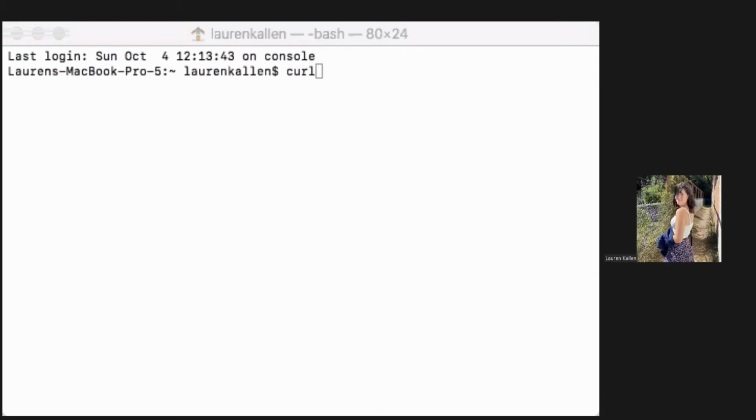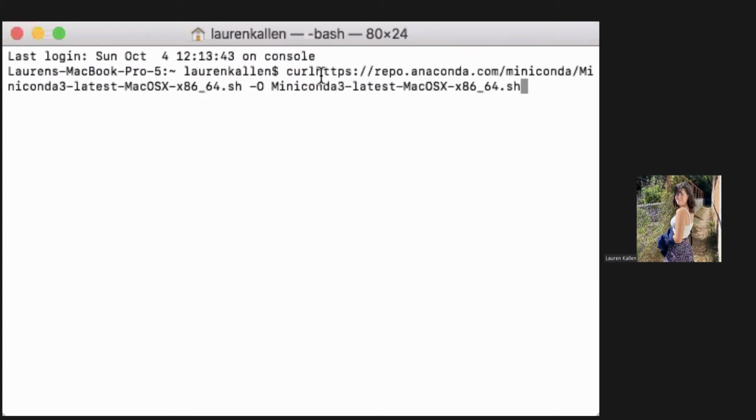So you said curl and then just like the rest of the website and everything? With the O. So what you could do is just select all of what I sent you. There we go. Like that? Yeah, you'll need a space after the L in curl. And to move there, you're going to actually have to use your arrow keys. Okay. Yeah. Okay.